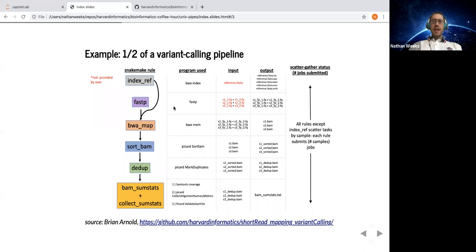And we're going to take this workflow, and I've translated it a bit to use Unix pipes instead of Snakemake. However, I've also done some tool substitutions, in particular Picard. That's a Java application, and our Jupyter notebooks are limited to 2 GB of memory. JVMs can use quite a bit of memory, and it might not work to run multiple JVMs concurrently. So we're using SAMtools instead.